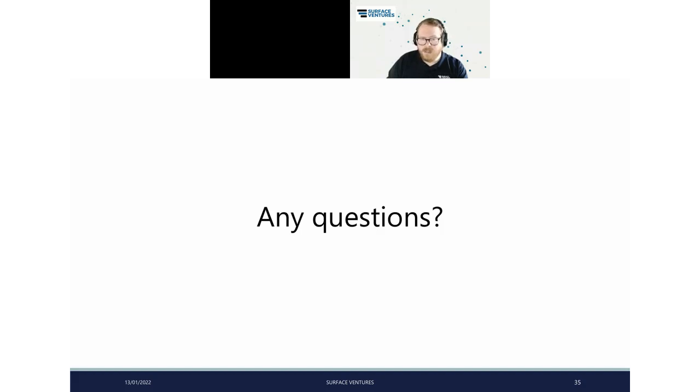So final question: is the Wilhelmy plate better or the Du Noüy ring method? How much better and why? Okay, I think I also very quickly comment on this one.